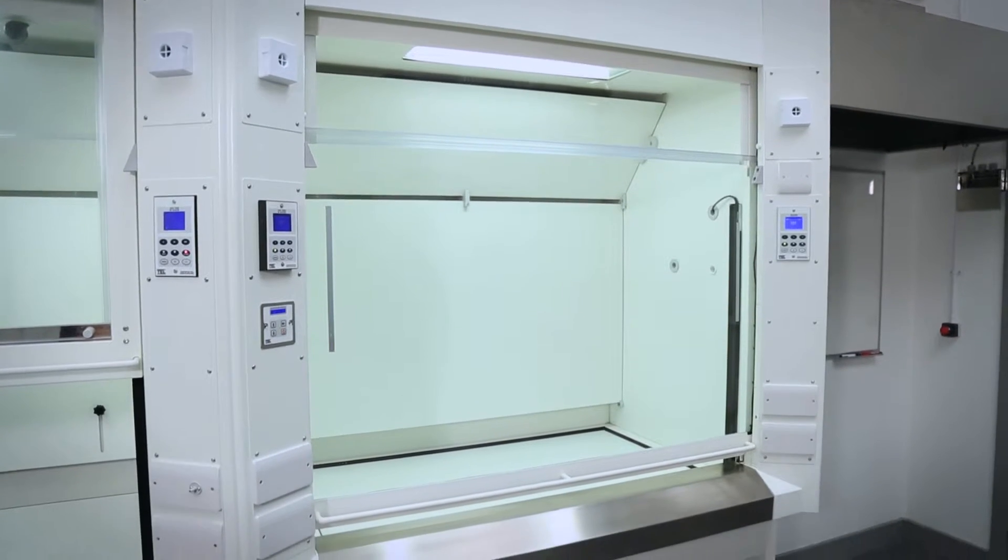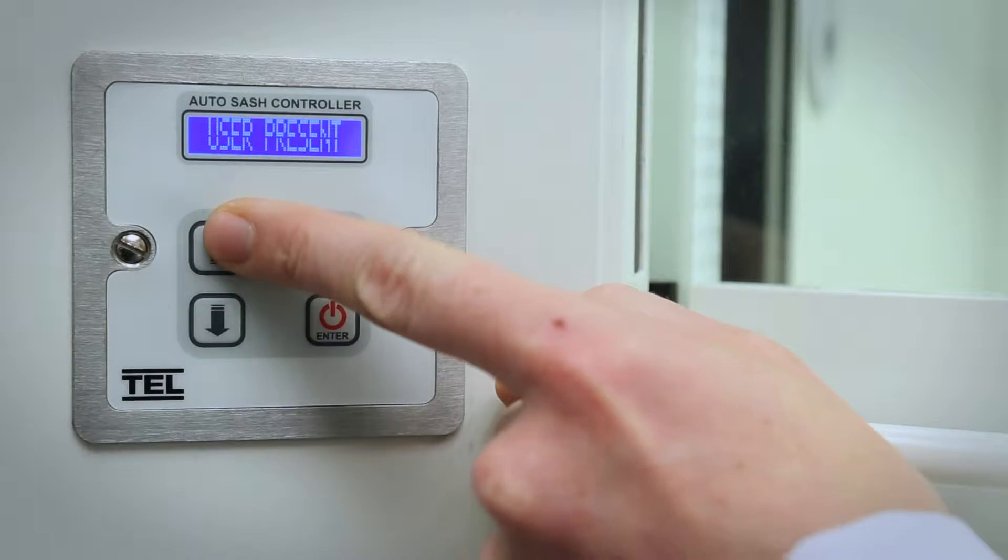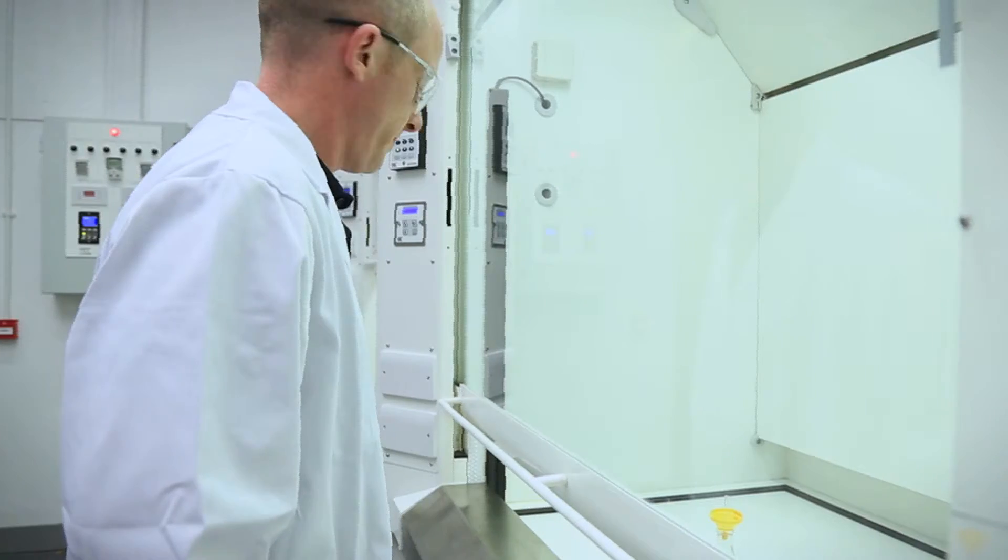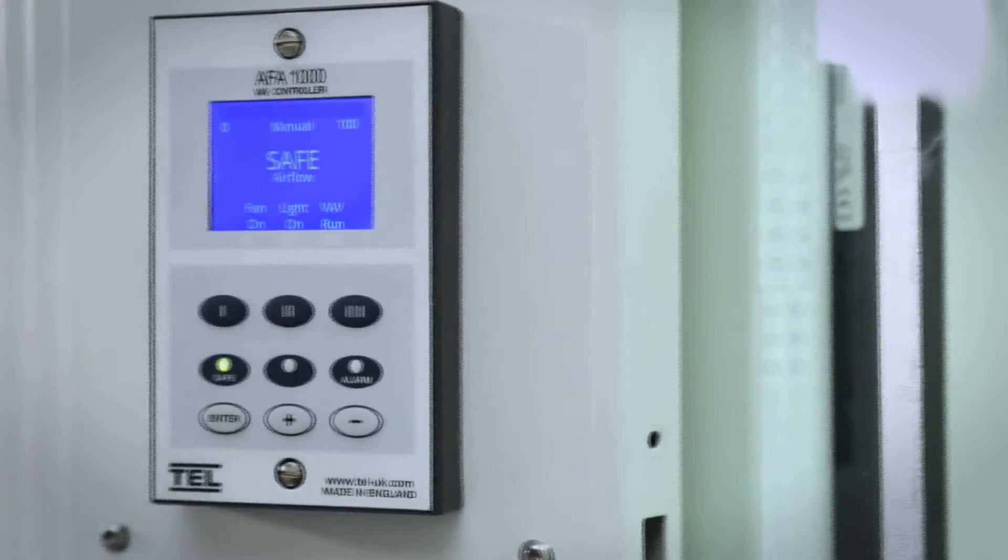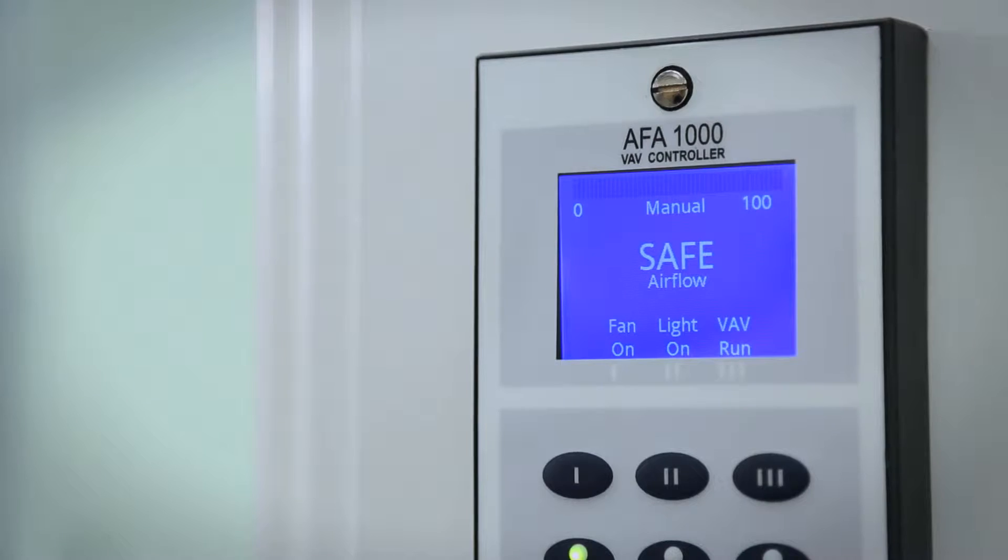TEL's innovative auto sash controller for fume hoods immediately increases the safety of your fume hood to its operators. It will also maximize energy savings when used with the VAV airflow controller.